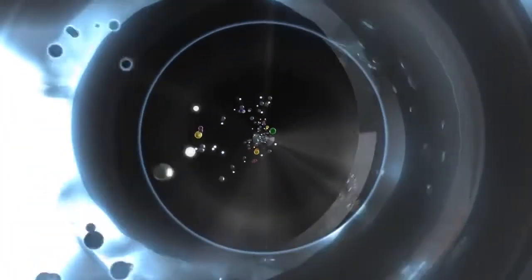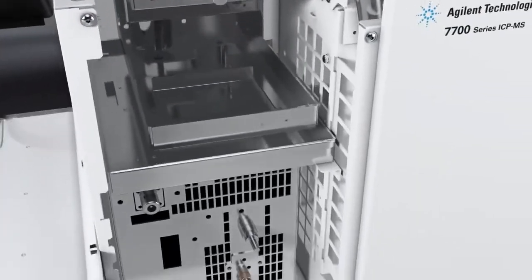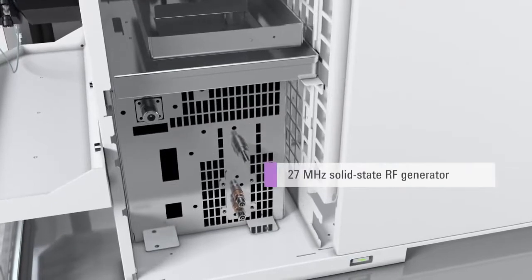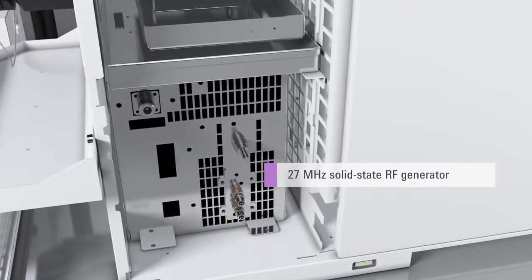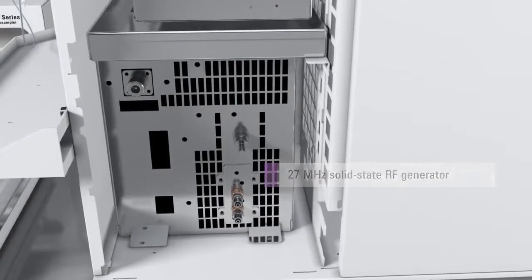The plasma of the 7700 is powered by a unique digital drive solid state 27 MHz RF generator, which provides the highest power transfer efficiency of any ICP-MS.